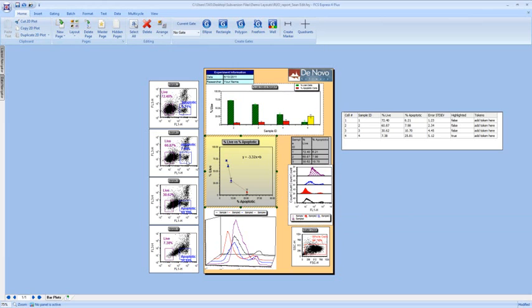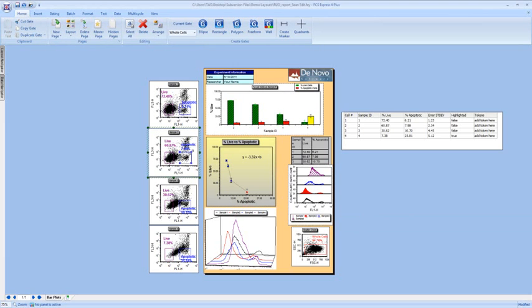The nice thing about any of these scatter plots is that as I move this gate, you'll notice I grab the apoptotic gate on the left, they're going to update in real time, right? So when you have a change that needs to be made to one of your gates, and say you've already set up your analysis in Excel, at some point you'd probably have to re-export that data if you need to shift your gate around, and then recreate that scatter plot. So FCS Express is going to allow you to do this in a more seamless fashion.